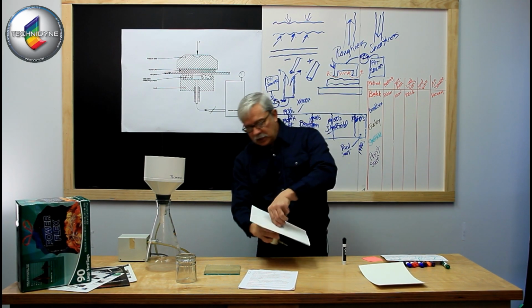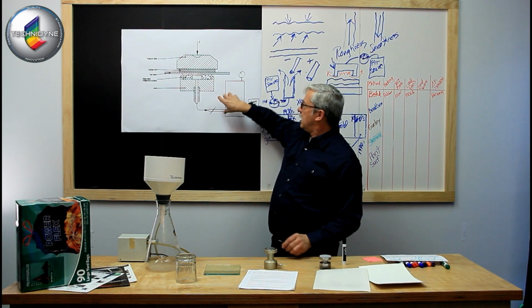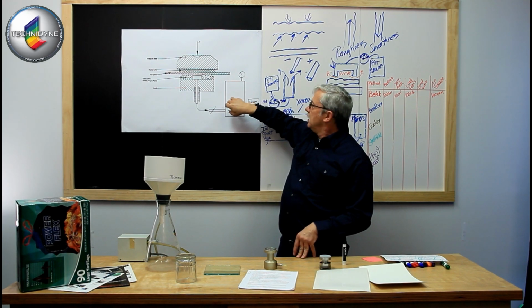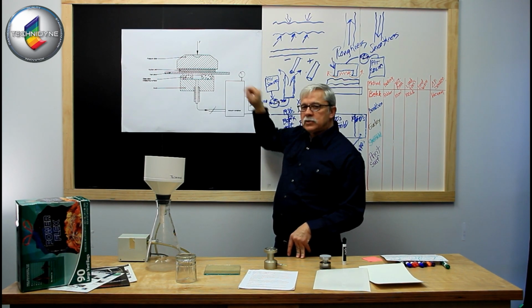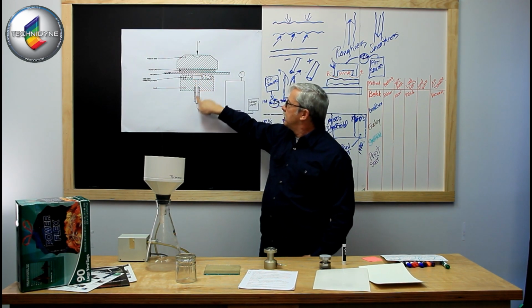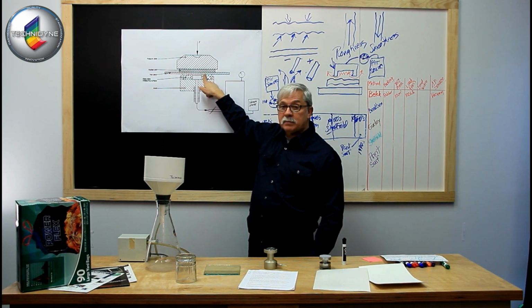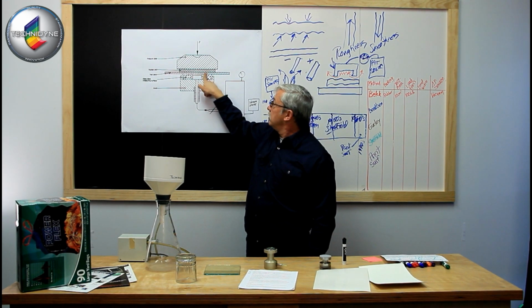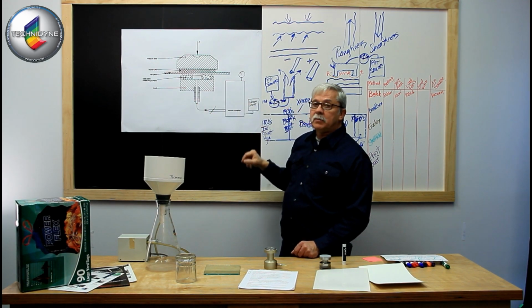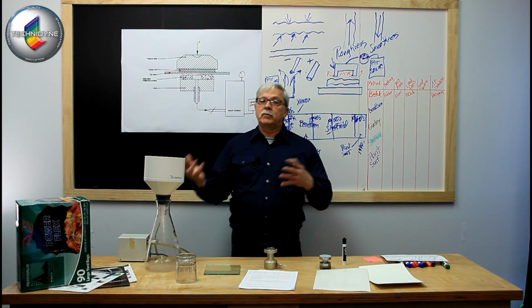Once I flip this switch, I have a switch here so that I can draw this down to a fixed negative pressure. I open this switch, and as soon as I do, any pathway across the surface of this paper that the air can take is going to go across the surface into my tunnel, into my chamber, and now I've created a pressure differential and I've created airflow.